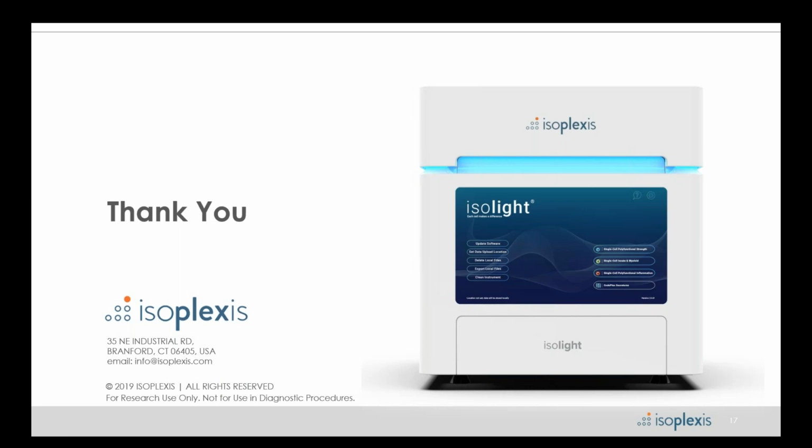A question for John: does the IsoSpeak software enable further clarity into what underlies the differences in polyfunctional subsets and where the single-cell contribution is coming from? Yes, thanks. With the IsoSpeak software, we can start diving into the intricacies of single-cell data and look at where these single-cell contributions are coming from.